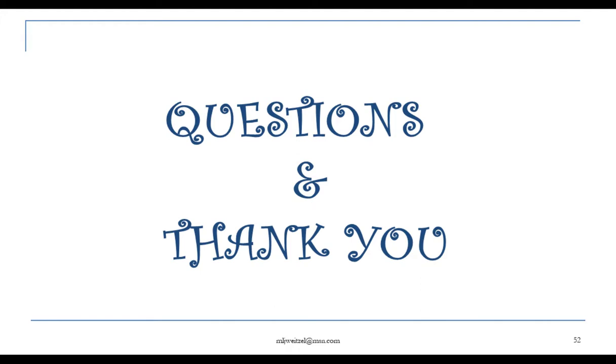Thank you, Jane. And again, I want to thank our audience for their questions. Jane, this next question is about certification. Should an analyst be able to prove that they are certified to verify instruments such as balances and pipettes?